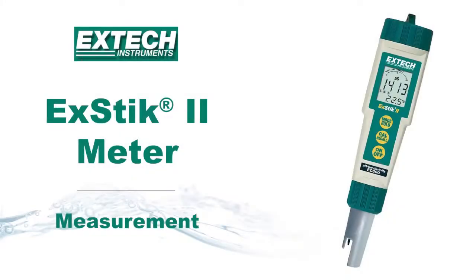This is a demonstration on how to take a measurement using the XTIC 2 meter from XTEC instruments.